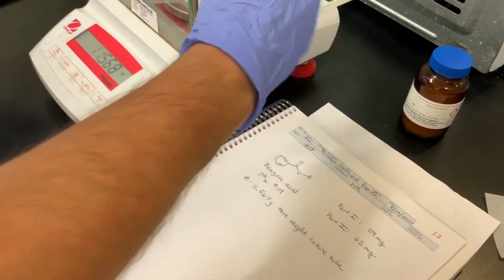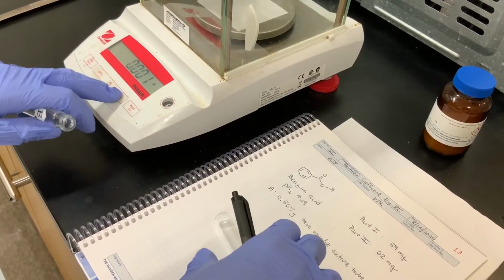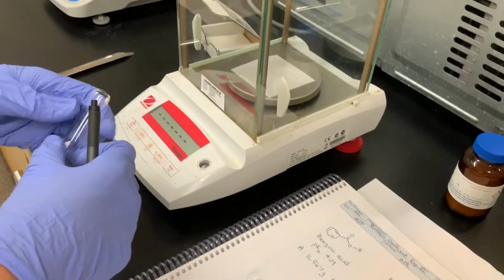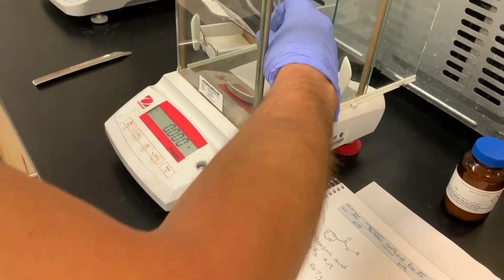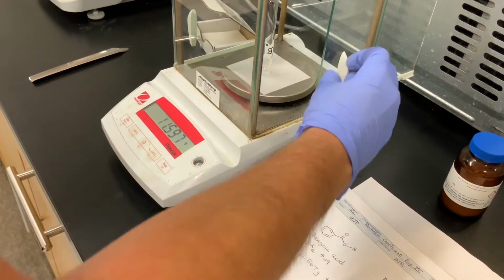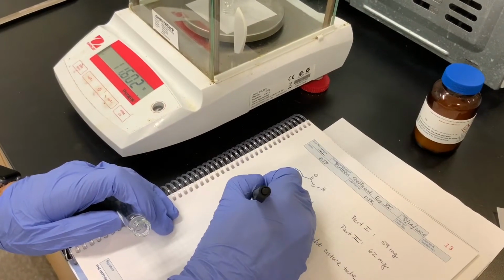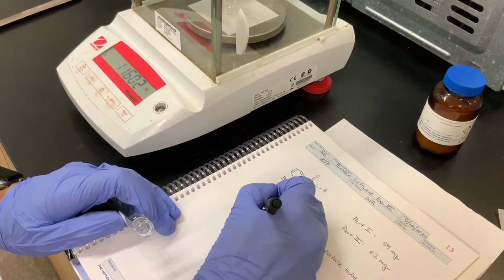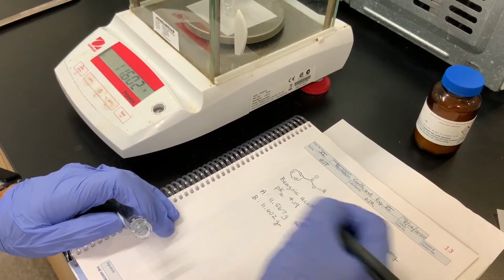And then I'm going to do the same thing for culture tube B. It's good to tare it in between. Tare the balance, I should say. And culture tube B, the tare weight is 11.602 grams.